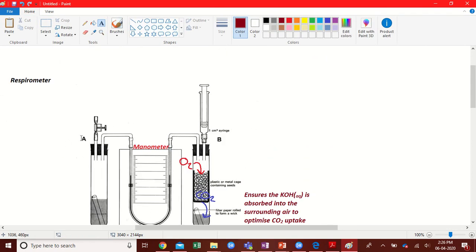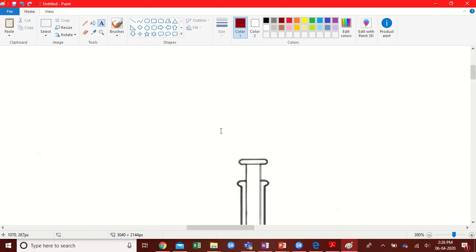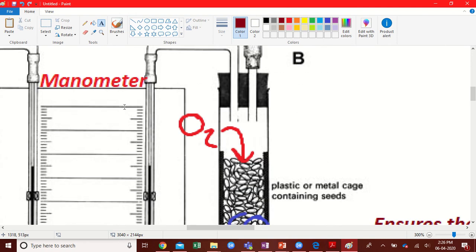I think that covers everything. The syringe there is to just incorporate more air into the system in case the manometer fluid gets past this point here. Or actually, well, you don't want it to get past this point here. You can also figure out the volume of oxygen that's been used up by measuring the amount of centimeters it moves in a certain amount of time.